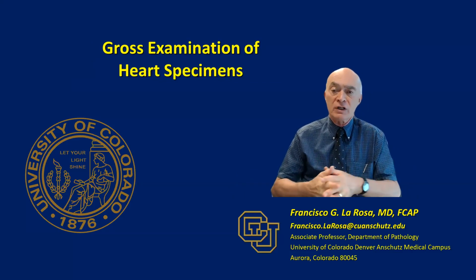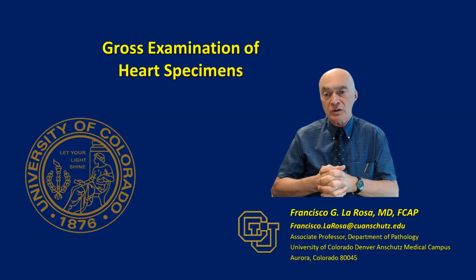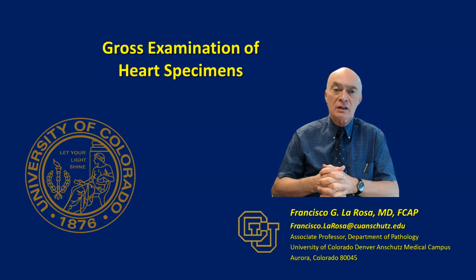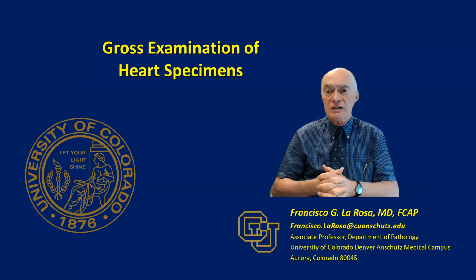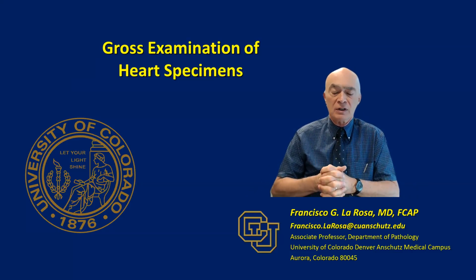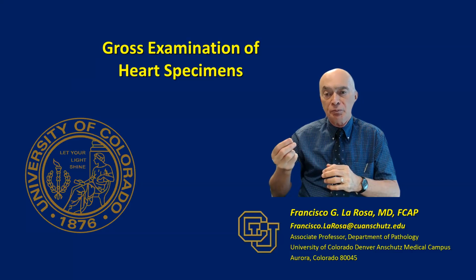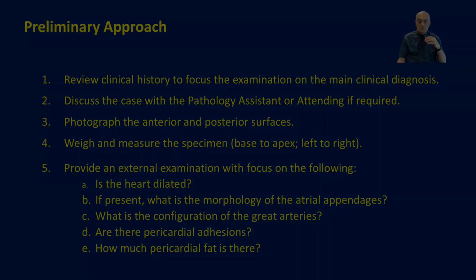First is the conventional autopsy specimen. The whole heart is being obtained, whereas in the case that is most common for all of us, in the transplantation procedures, the explant is a heart that has to be sectioned at the level of the atrium to be able to leave the pacemaker that is present in the right atrium.